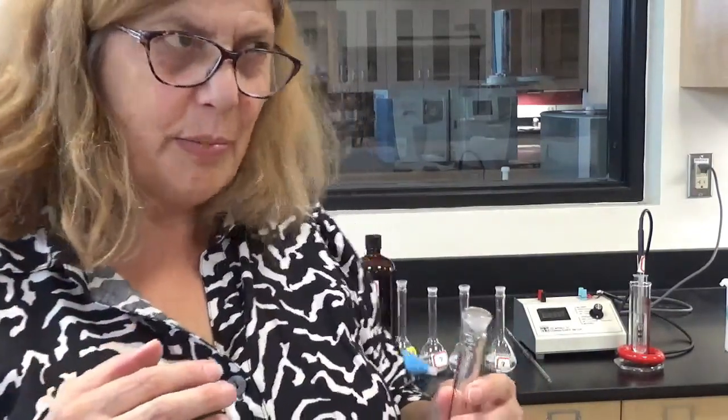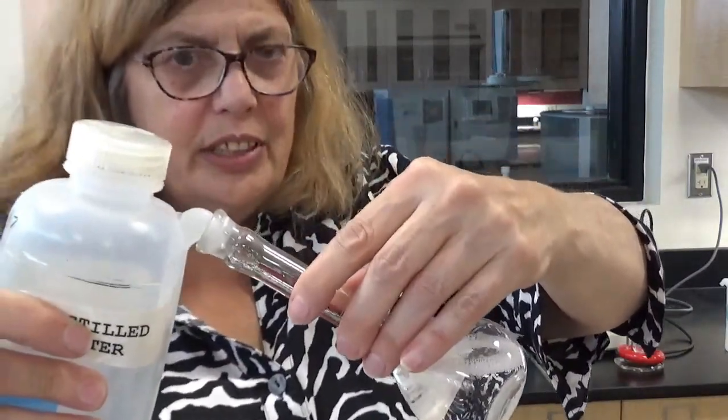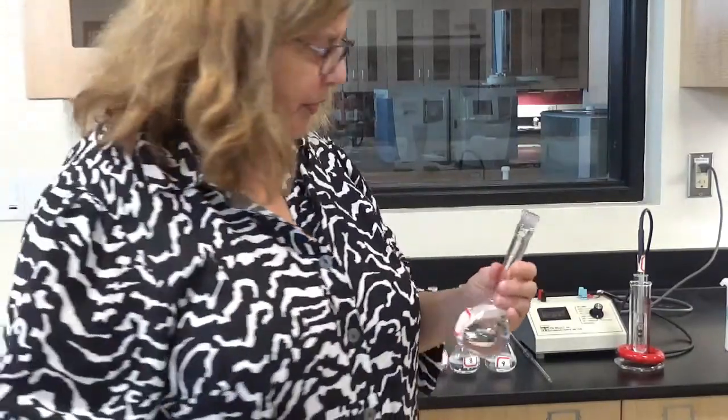I know I can't see a meniscus, but it'll be easier if I don't have a giant amount of foam at the end. So that's why when I fill all of these, I go very gently down the neck of the flask. And I'm going to get close on all of them before I get a dropper that comes out a little slower than these water bottles.